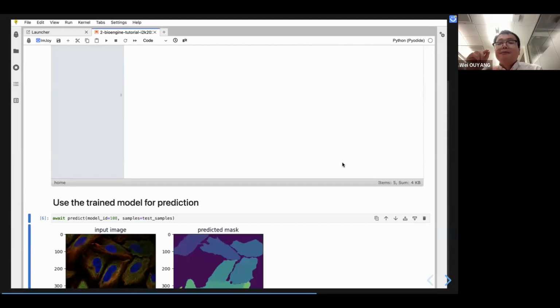So the minimal setup, the easiest if you deploy it on a workstation, is to have a GPU and a Linux system like Ubuntu. That's the easiest. We can still support Windows and other machines, but then you need to get Docker installed. If you have these things there, it should be easy. Just do Docker Compose up.